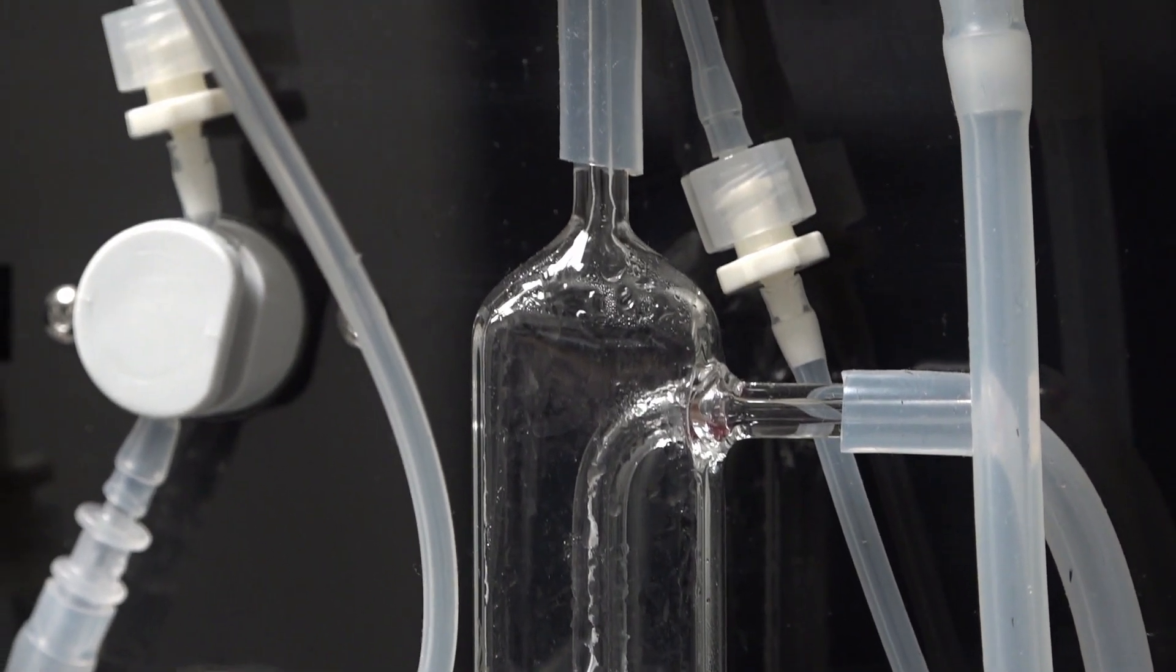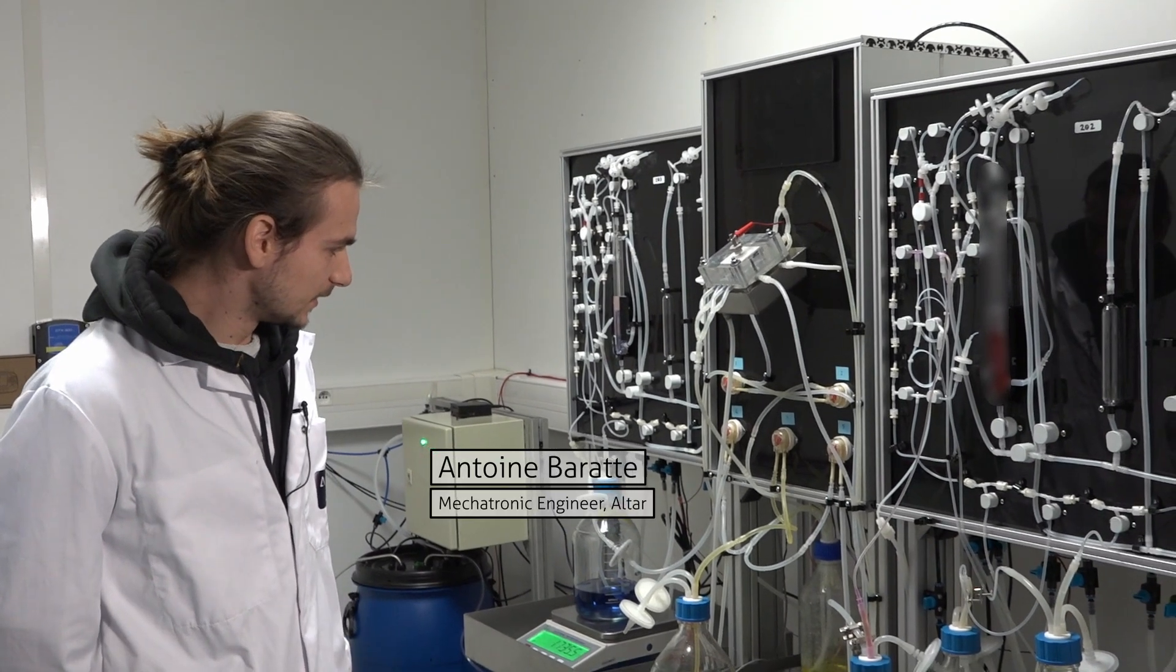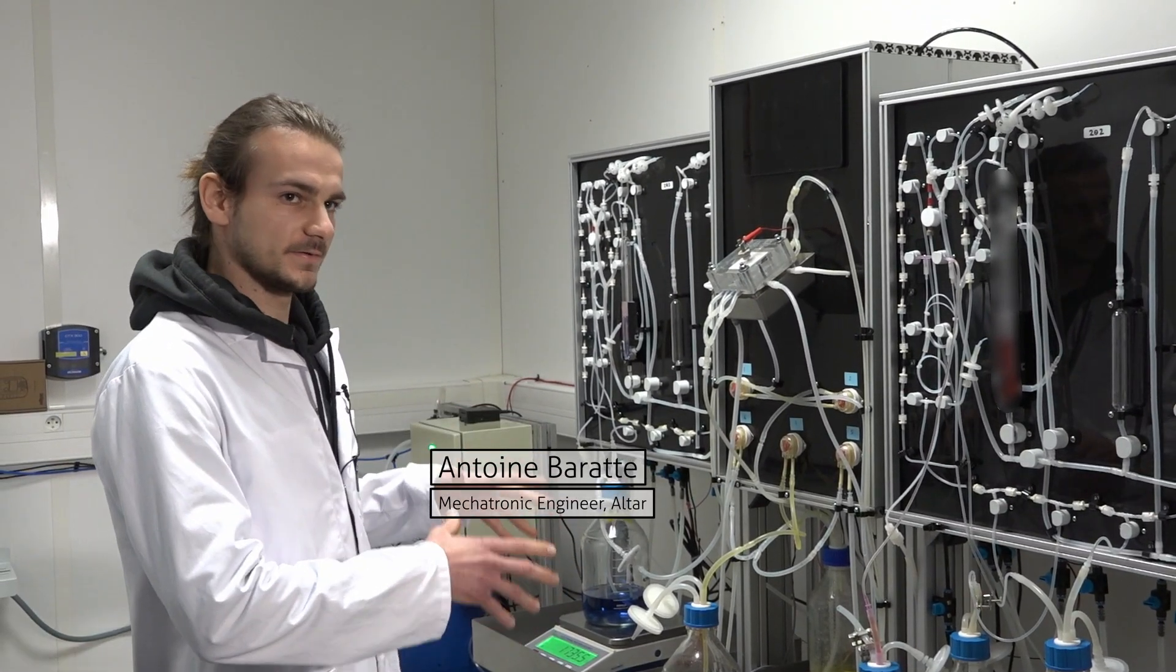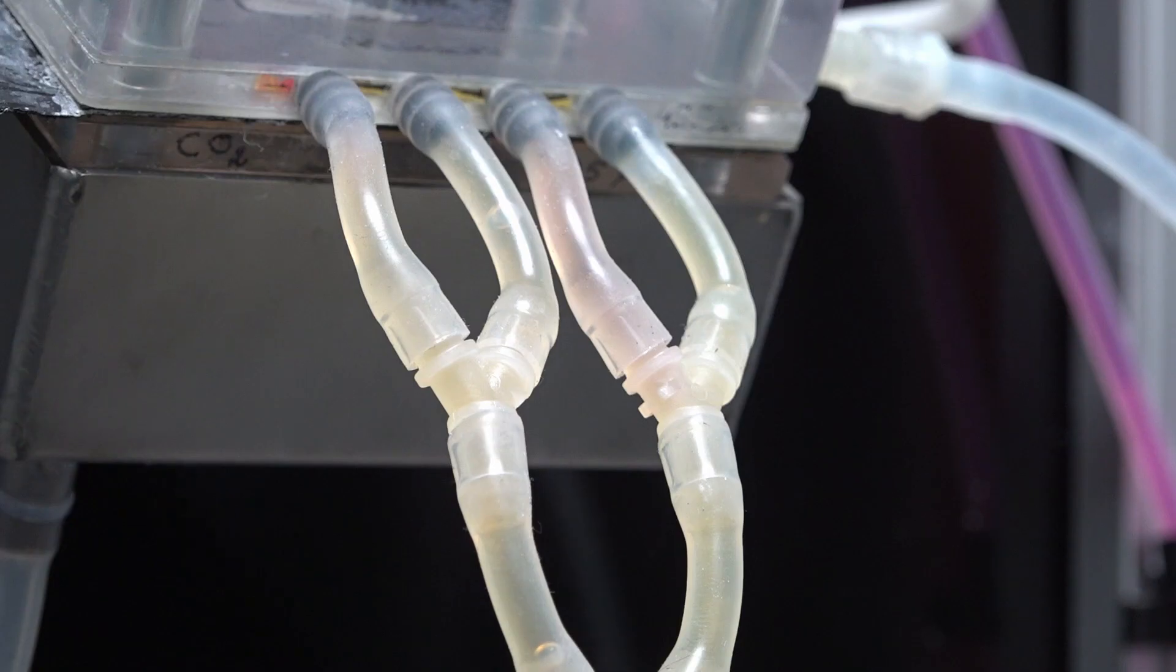Here we have a fully integrated electro-bioreactor for the E4Fuel project. We received various parts from the partners from the project, especially the electrochemical cell we received from Stuttgart.